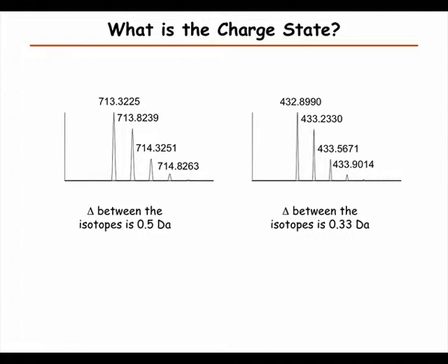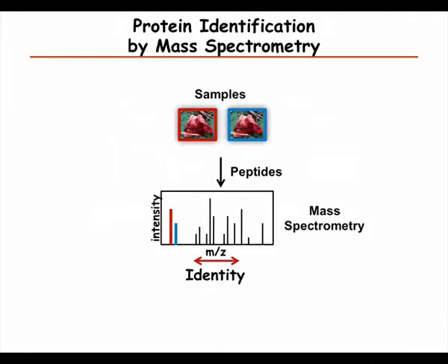This is something that is used, of course, in software. Now, as I said before, protein identification: what we do there is we take the mass to charge ratios and try to go from there to determining what is a peptide, and what peptide it is.